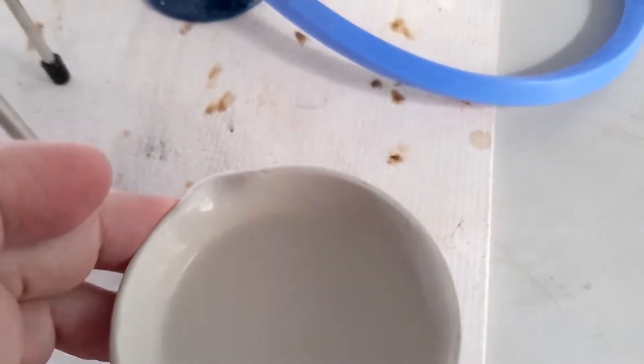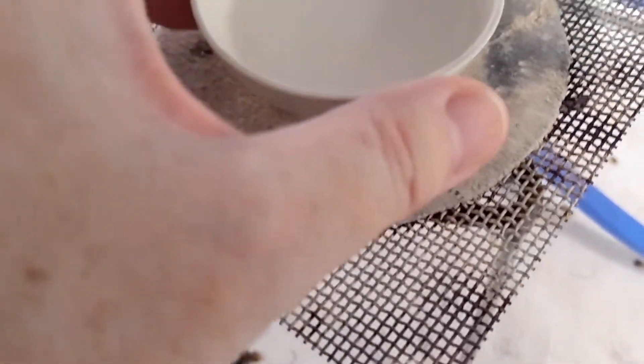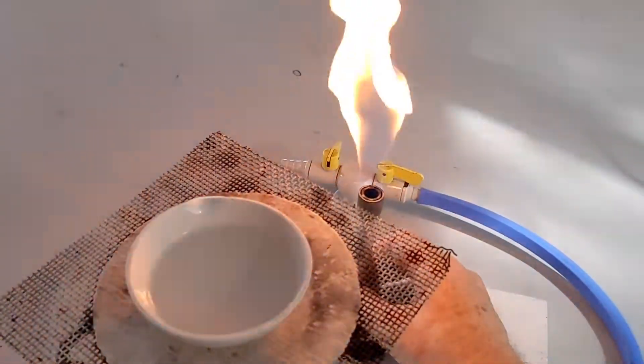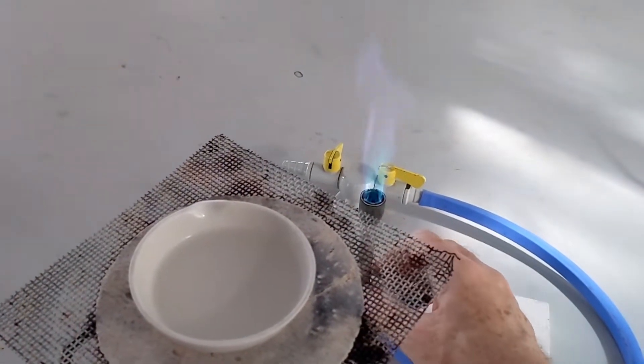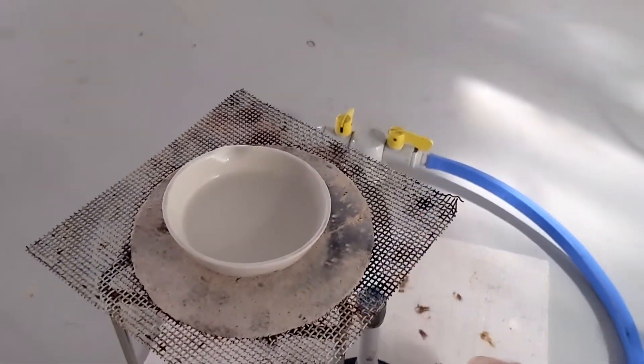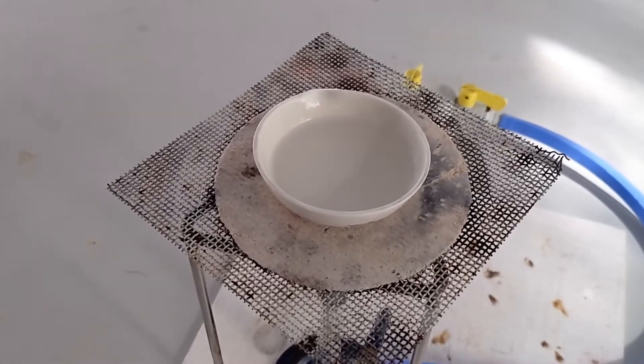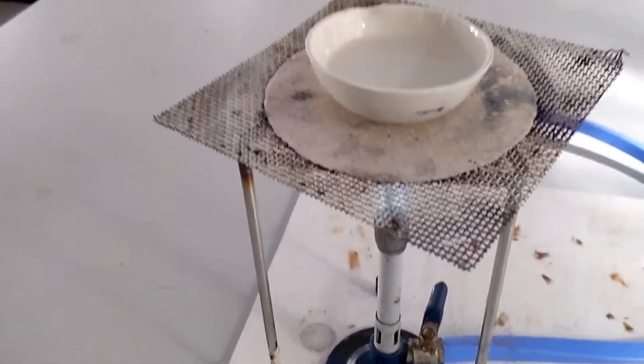We then need to heat our evaporating basin using a low Bunsen burner flame until crystals just start to form around the edge. Again, this will take some time.